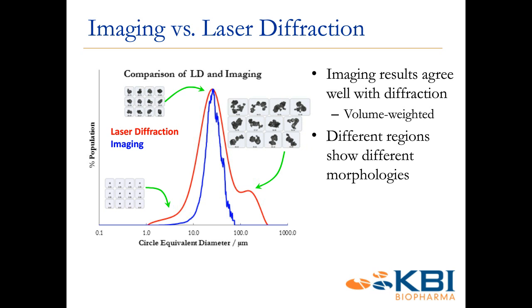And with small molecule, we can collect that Raman signature quite quickly. So we can analyze thousands of particles in a couple hours, and it is automated. So it's kind of introduce the sample, push a button, walk away, and get your data.